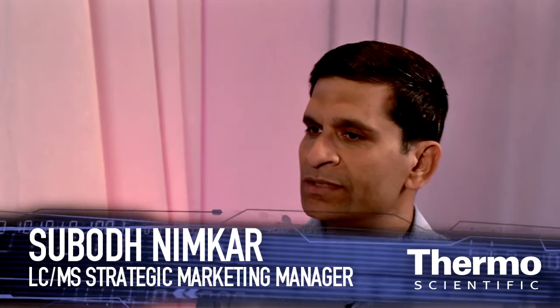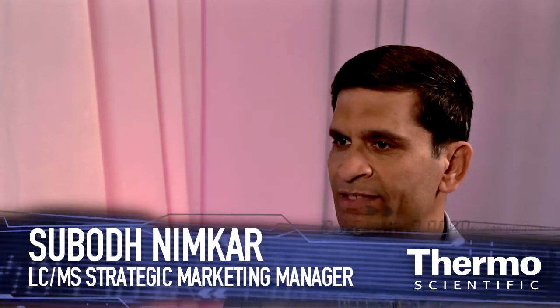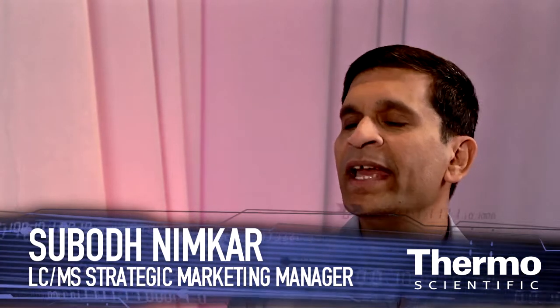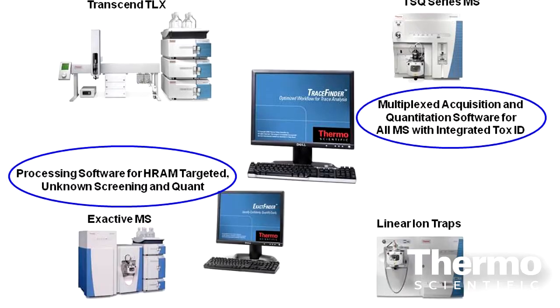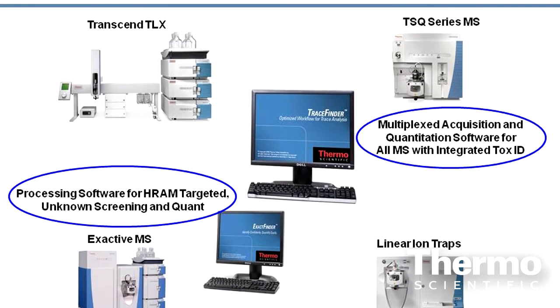TraceFinder 1.1 software that we have released here at ASMS is the next generation software for TraceFinder 1.0. This has been primarily designed for quantitative analysis of all Thermo mass spec systems, including control of our Transcend multiplexing system as well as other HPLC systems.